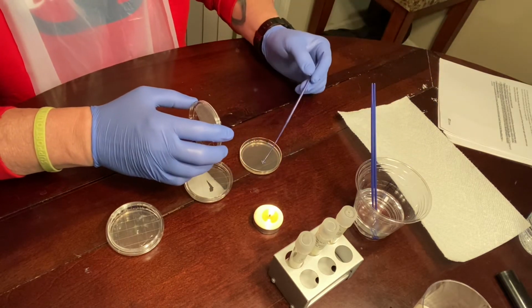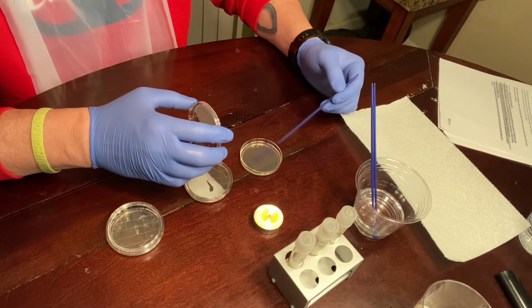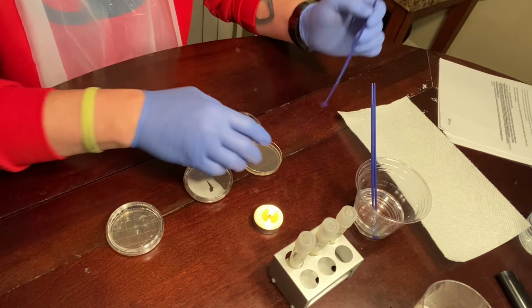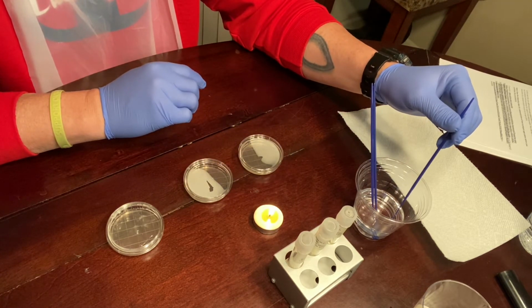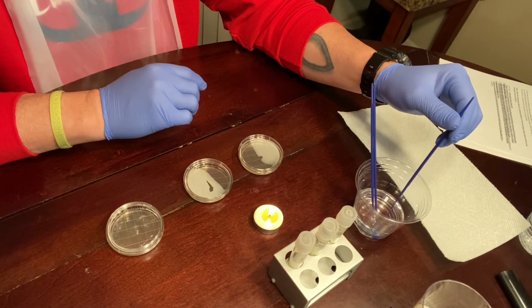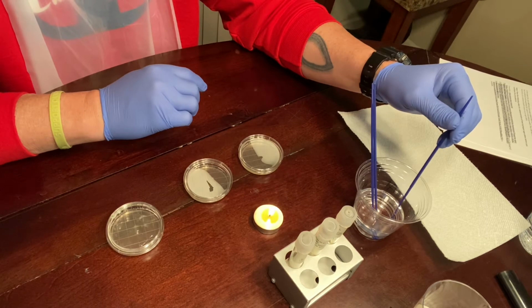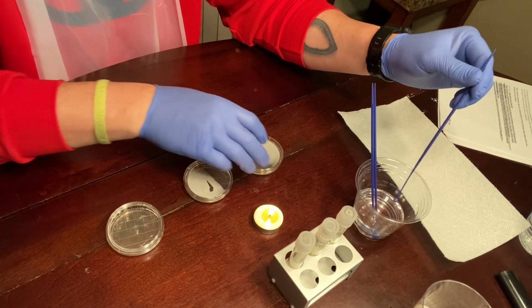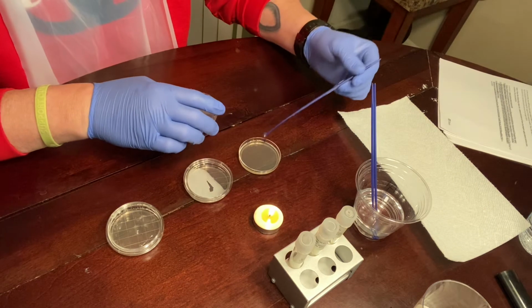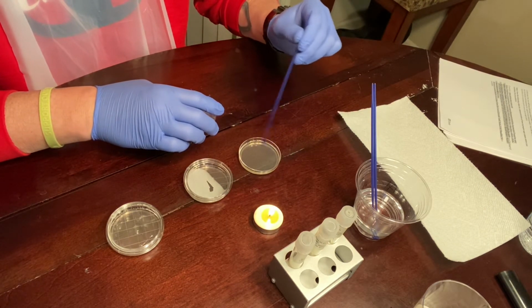So then I'm going to take samples from the first one and move it to a second area of the dish. Put the lid on, soak it again. Then we go from the second quadrant into the third quadrant in a zigzag motion.